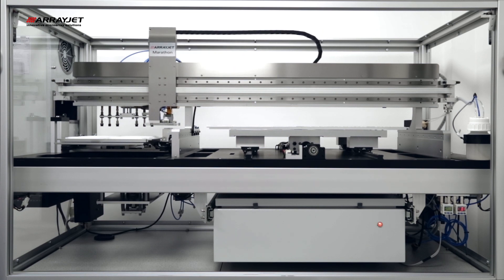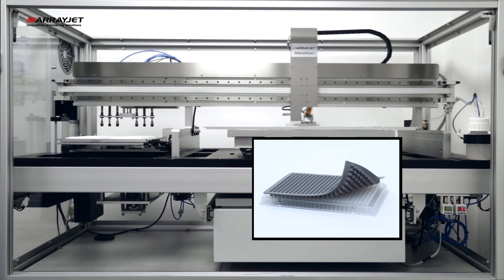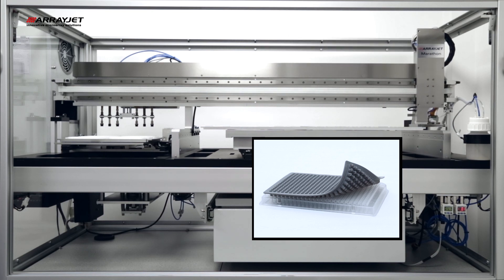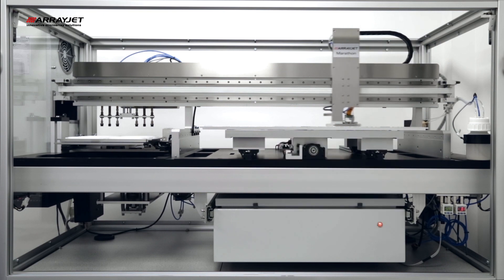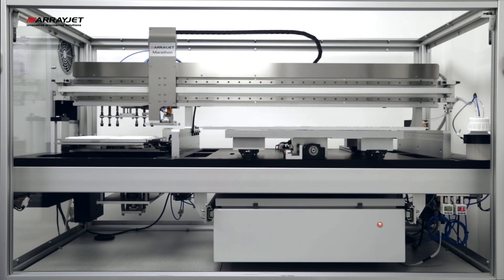ArrayJet's unique JetSpider technology is compatible with JetGuard sample protectors. This disposable septa can be applied to sample microplates to seal each individual well to effectively prevent both sample evaporation and the potential for contamination.